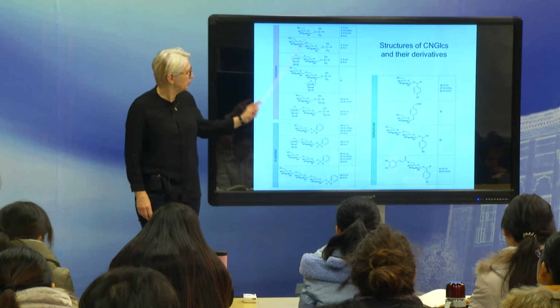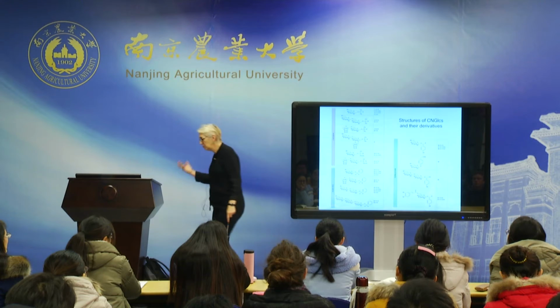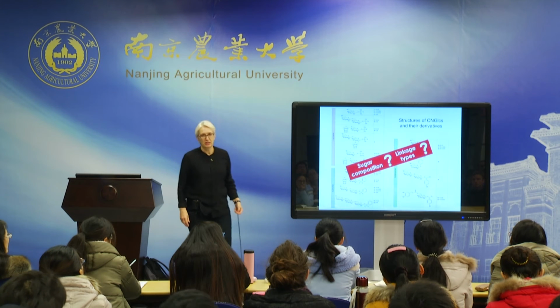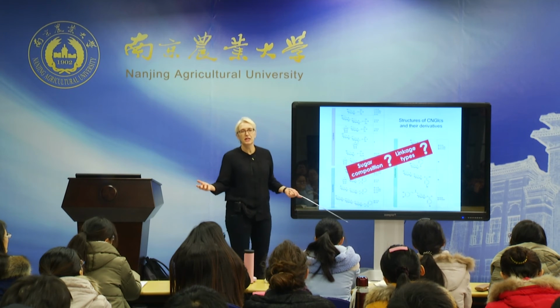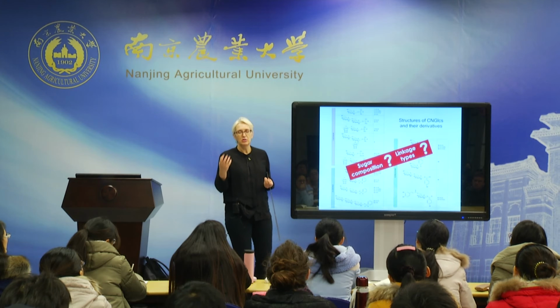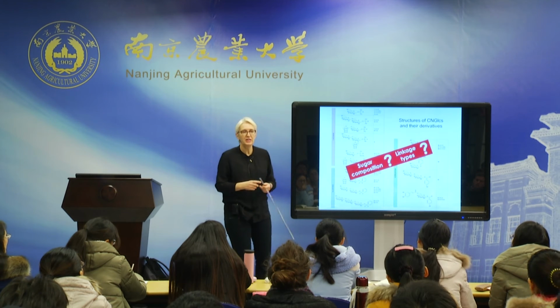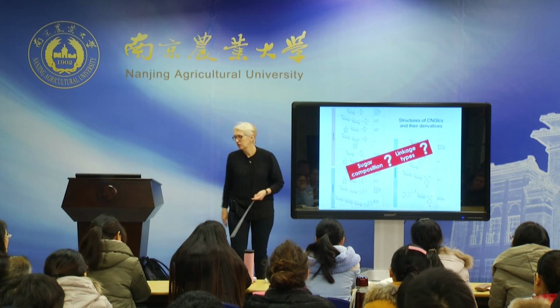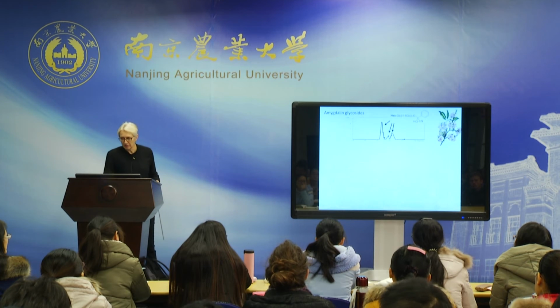So this, we thought, was a very beautiful target to use our sequencing strategy to identify their metabolites and see, can we use it now in a real example, where we really need some more information. Also, we were quite attracted to the fact that these are quite small structures. Sugar composition, which sugar we actually have on there, galactose or glucose, we couldn't really do. What linkage type? Of course, if you got enough of one of them, you can do NMR. You can, of course, synthesize all the different standards and compare them by HPLC, but this is all very difficult. You've got different aglycones, you have to make all the different standards with different aglycones, with the different linkages. Really quite complicated. So we proposed we have this simple, fast sequencing strategy. Can we help them with the analysis?